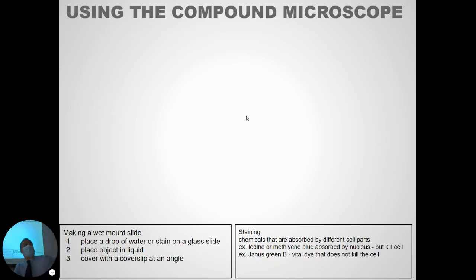So we're going to use microscopes today in our second block. And so we're going to review the procedures, or how to do that, because whenever we do a microscope lab, oftentimes people can't find an object or they're having trouble focusing. So it takes a little practice, but once you know the correct procedure, it's not too difficult. So we'll review that and then you can practice it today.